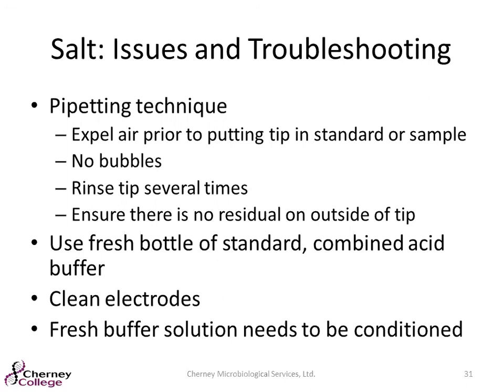Make sure your standard and your buffers, all of those, are fresh, clean electrodes, and condition when you're supposed to. But the pipette technique is probably the hardest for reproducibility. So making sure that your technicians really are comfortable and they have the technique down, because that can really affect your salt result.